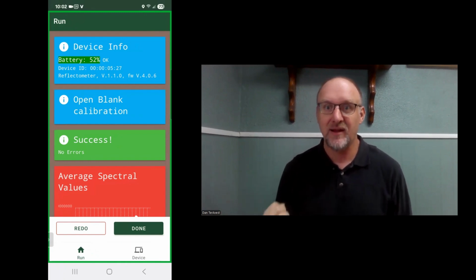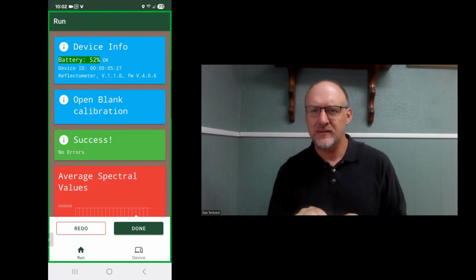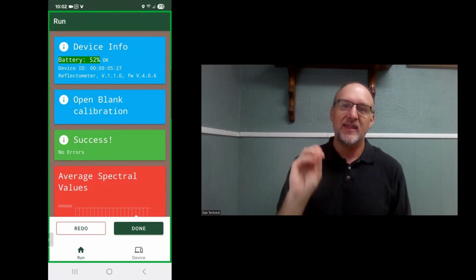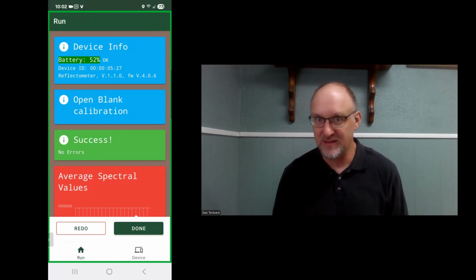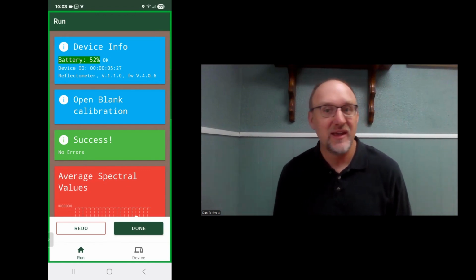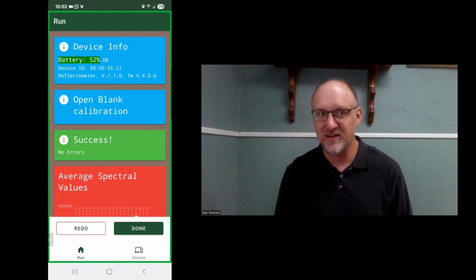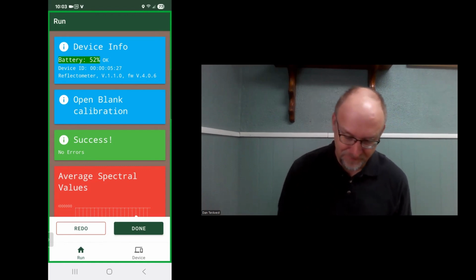little reflectance back. One thing that's important to note: the LEDs, we pulse them. So they're flash, flash, flash. That allows us, within the software, to filter out any ambient light that isn't pulsed. So the overhead ceiling above me, the daylight from the window next to me. If you're out in the field and it's a sunny day, the fact that there's sunshine where you're calibrating the device shouldn't matter, because we're filtering out that ambient light and only measuring the pulsed lights from the LED.